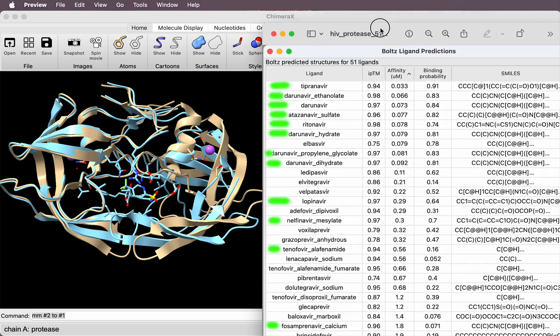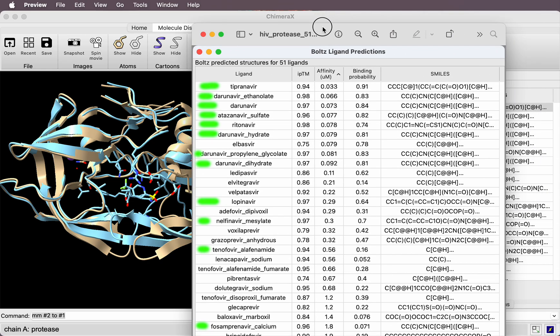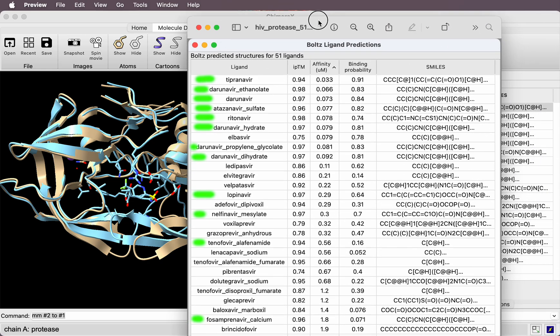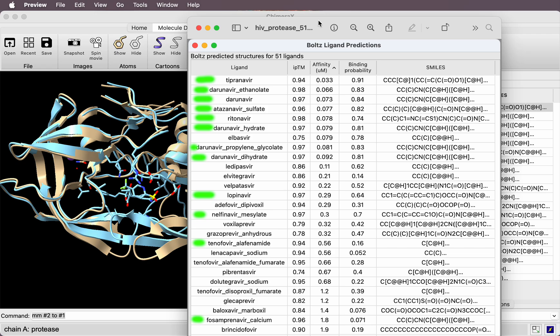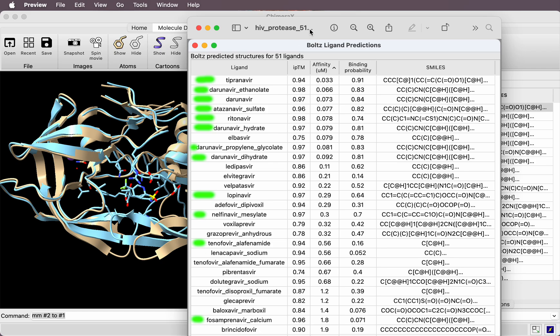I made a copy of this table as an image to highlight the ones that are actual HIV protease inhibitors. You'll see here where it's sorted by binding affinity—all of the 10 or so known HIV protease inhibitors are near the top of the list of these 52.